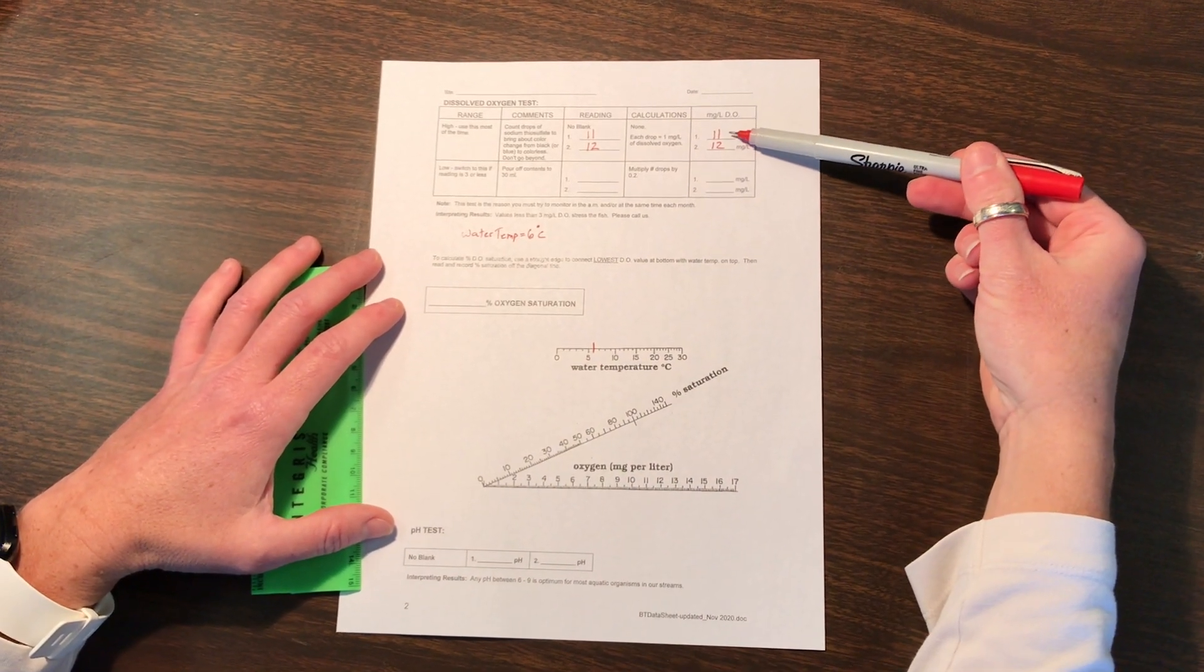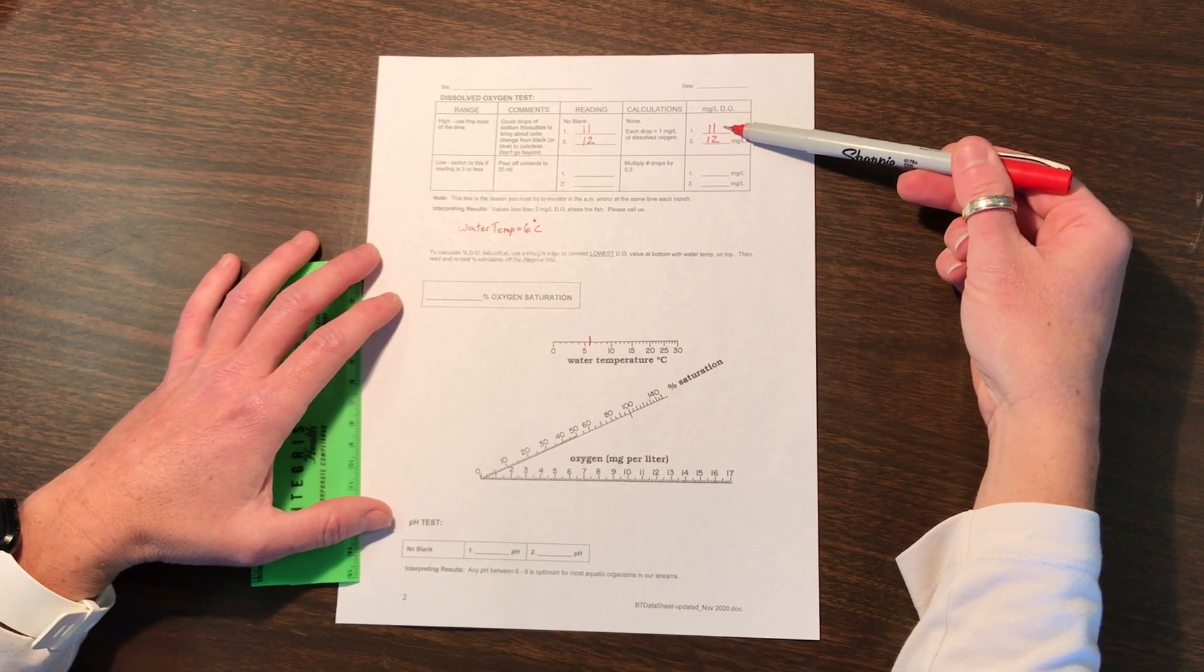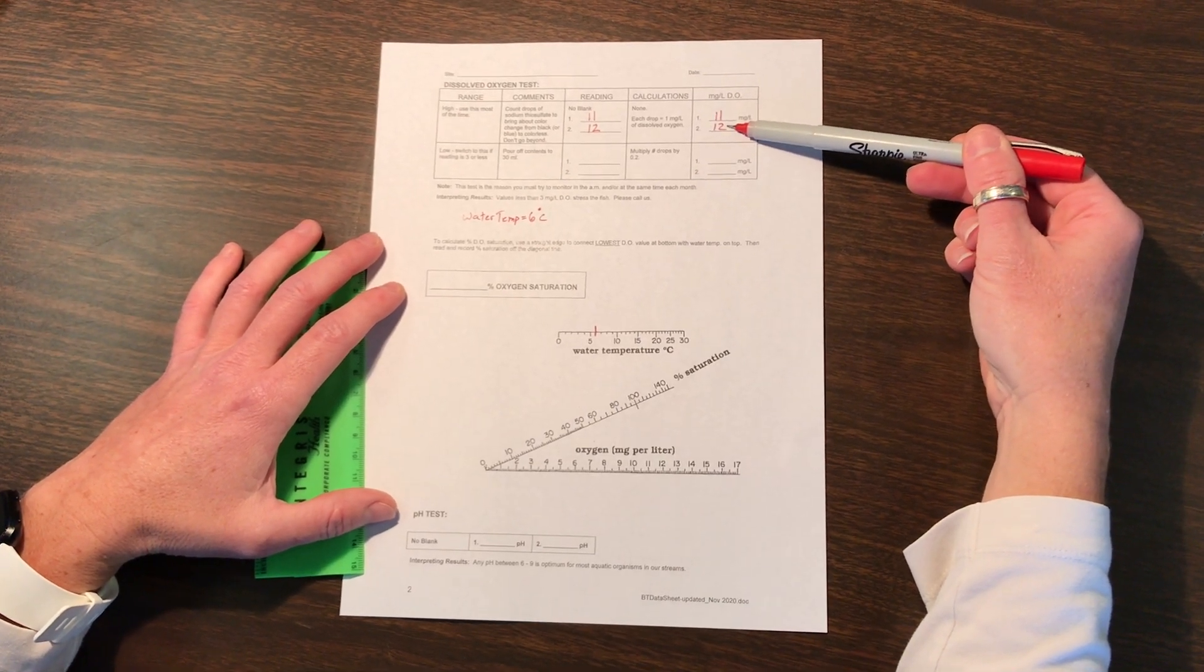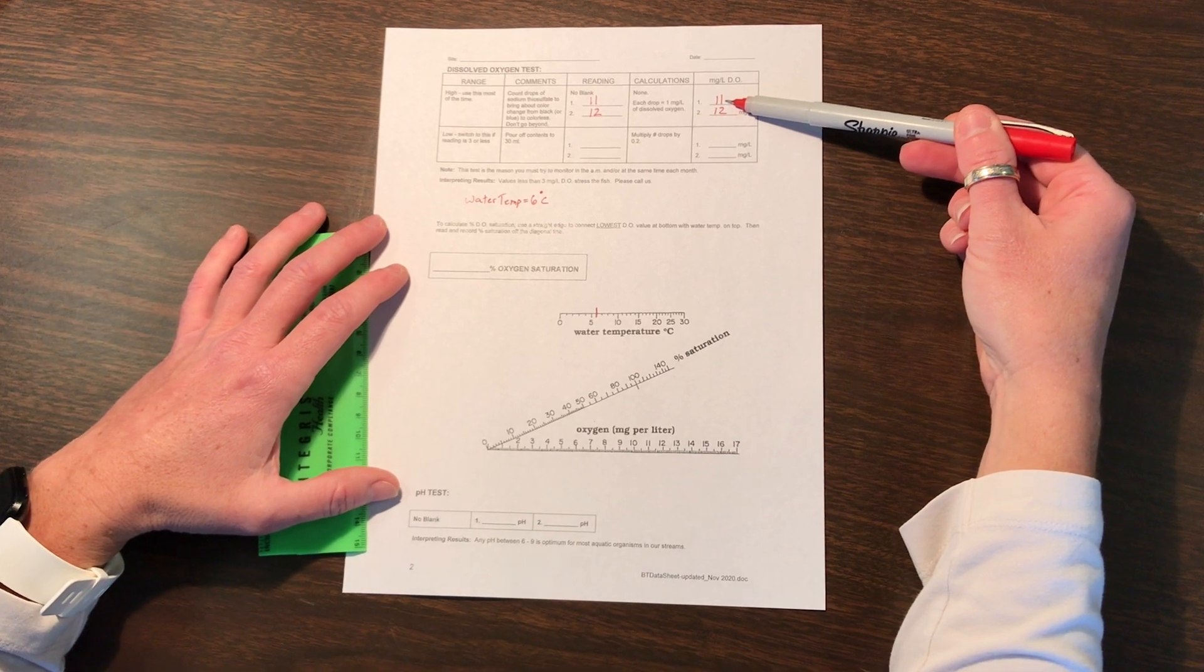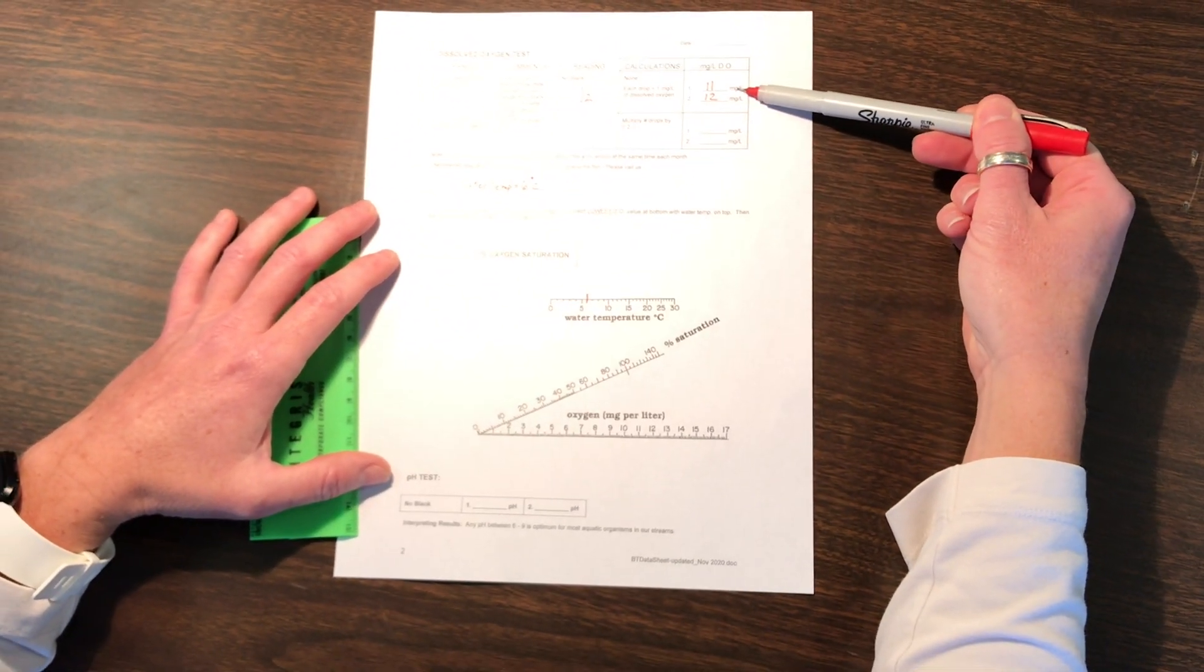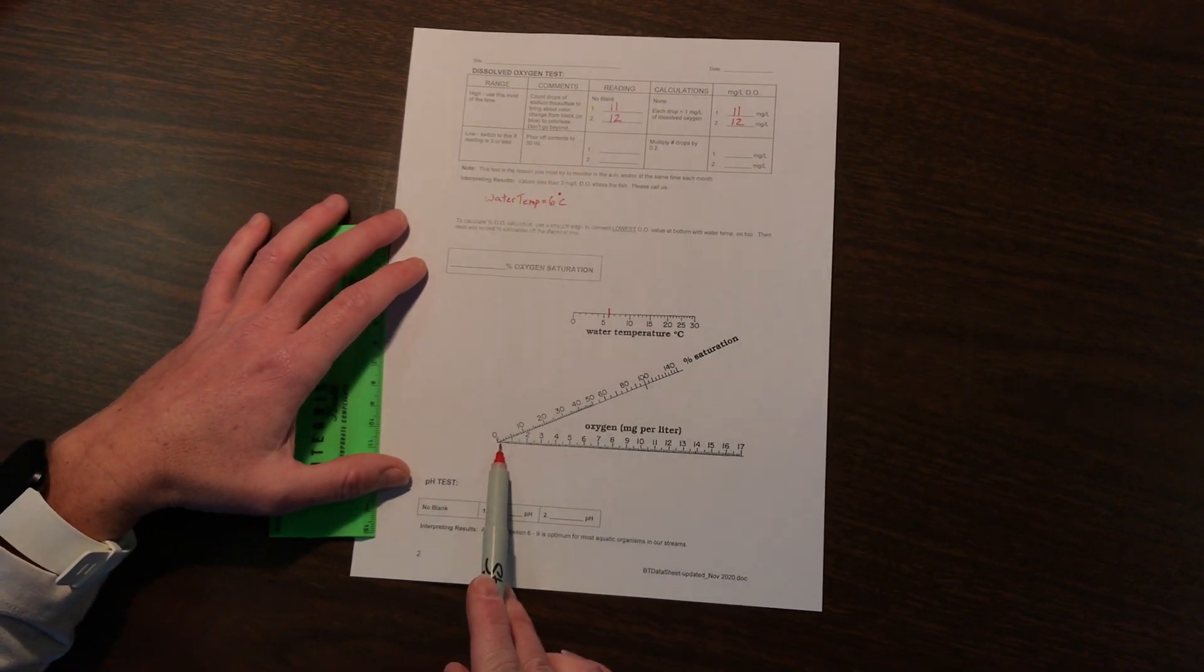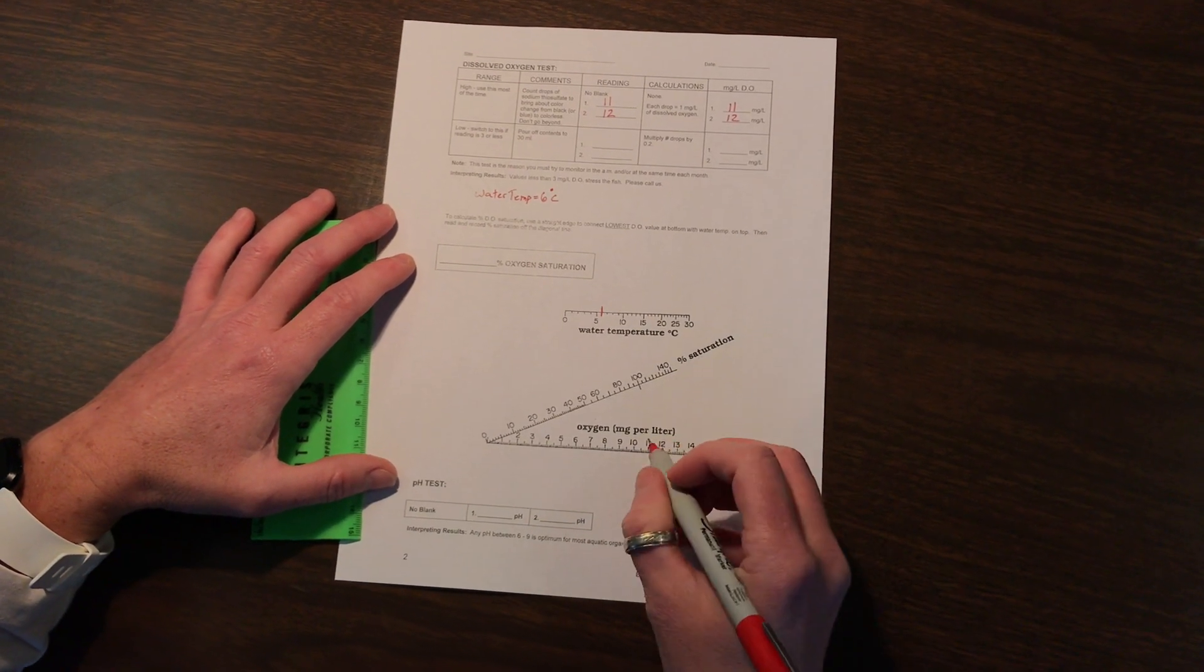With our dissolved oxygen, since we have two different numbers, they are still within good quality assurance—within at most 2 drops difference. We have a 1 drop difference. Always use the lesser, the lower amount of oxygen. In this case it would be 11 mg per liter. Our mg per liter of oxygen is going to be this bottom axis, so we'd make a mark at 11.